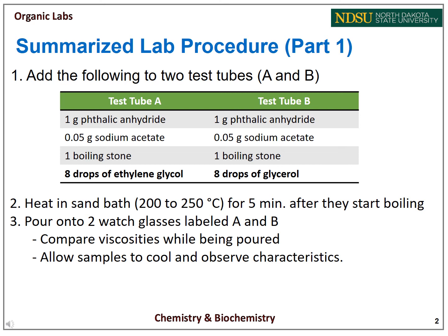After you heat the two reaction mixtures, pour them on your watch glass and then compare the viscosities of them as you pour. And then once it's cooled, compare the characteristics of the resulting polymers.